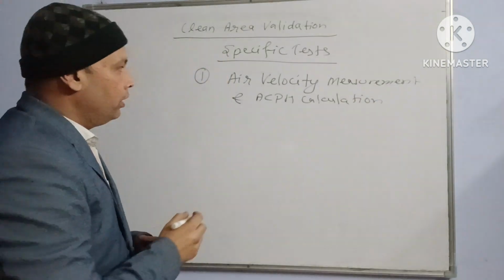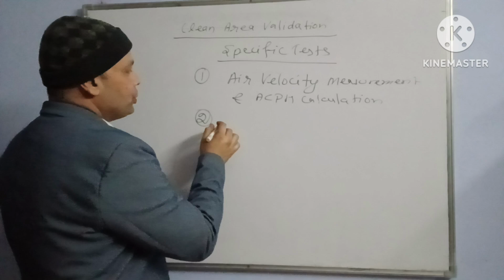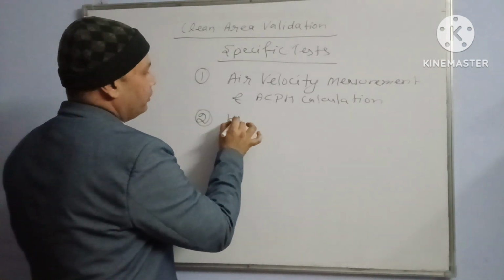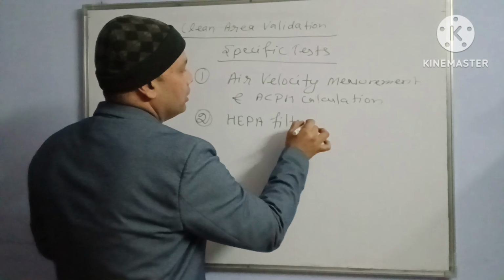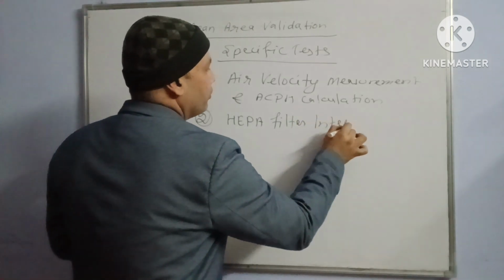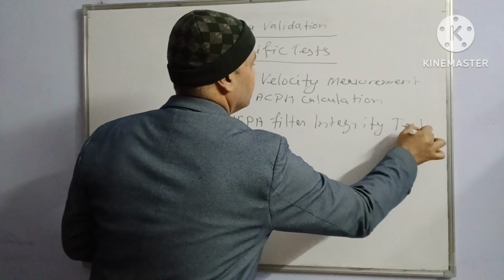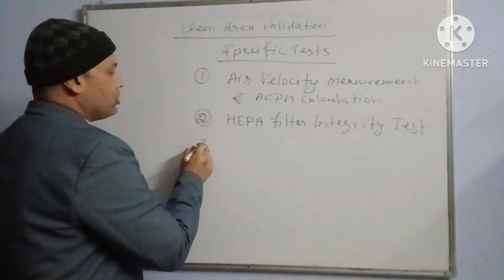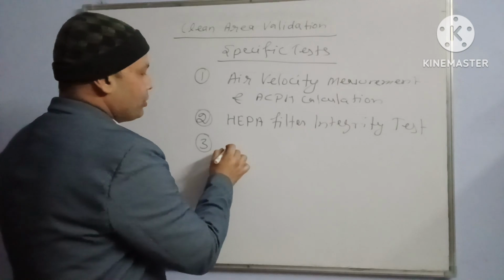Then we perform the HEPA filter integrity test. Then next we perform the airflow pattern test.